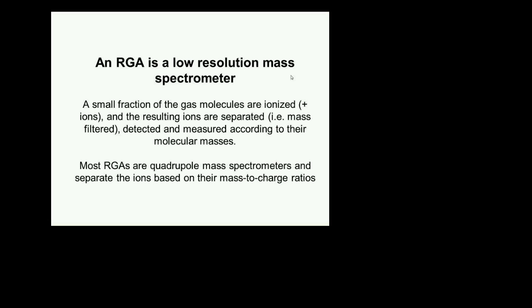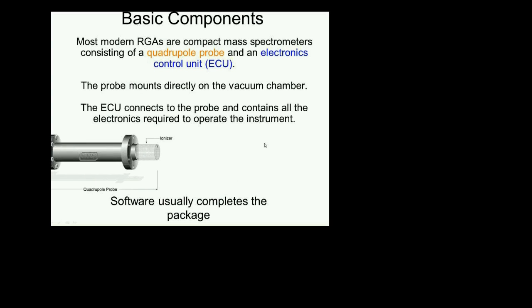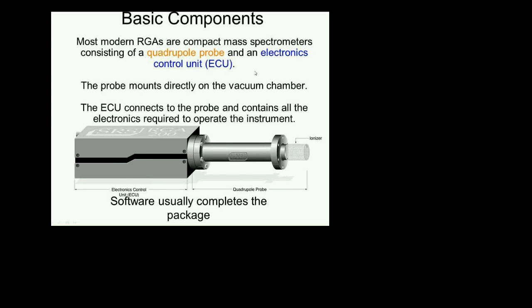Quadrupole mass spectrometers literally filter the ions based on their mass-to-charge ratios, as we're going to see. So we talked about this. Our main focus will be quadrupoles. So let's start talking about quadrupole mass spectrometers.